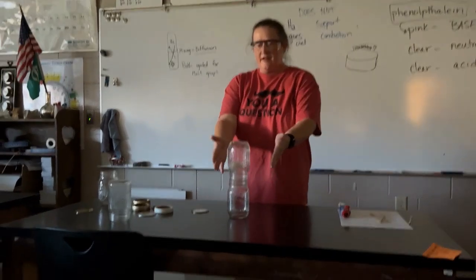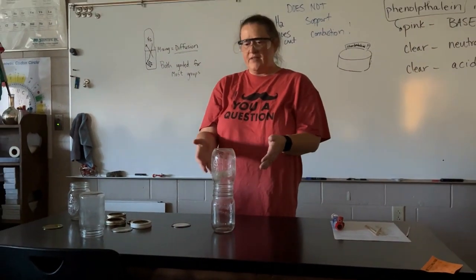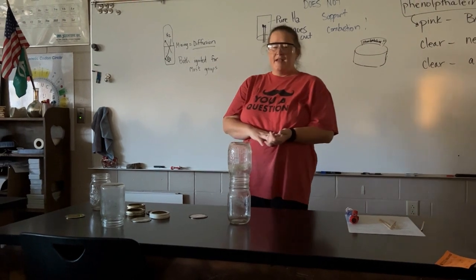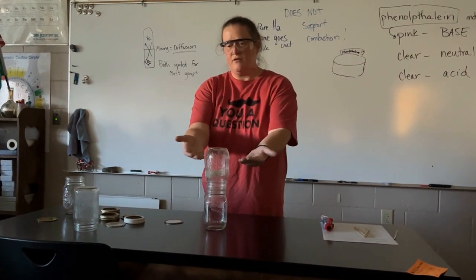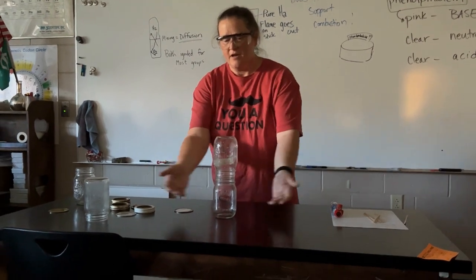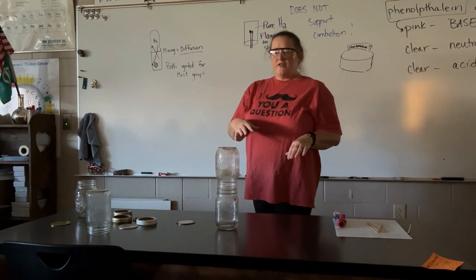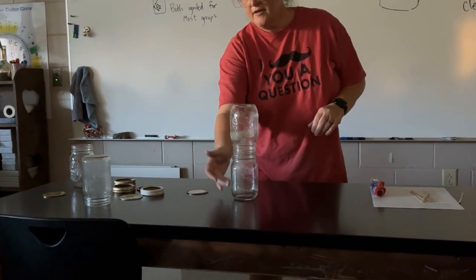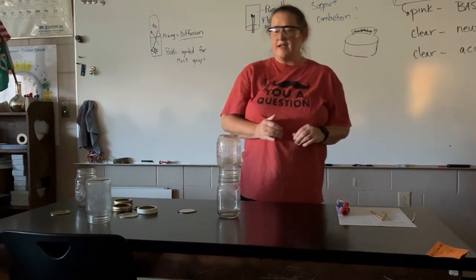The table here, in our properties of hydrogen lab, represents a simulation of bottle 4. In bottle 4, we were to take the bottle or jar of pure hydrogen and place it over a jar of air. In this demonstration, I have modified it a little bit, and I put pure oxygen on the bottom, and we've got pure hydrogen on the top.